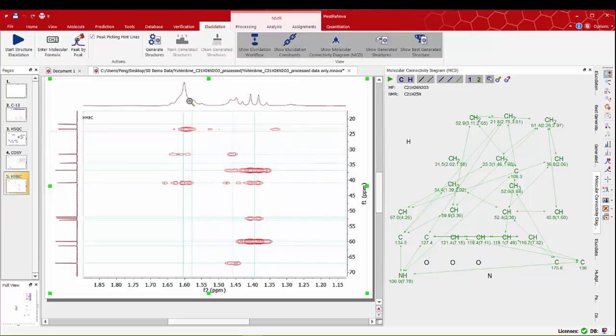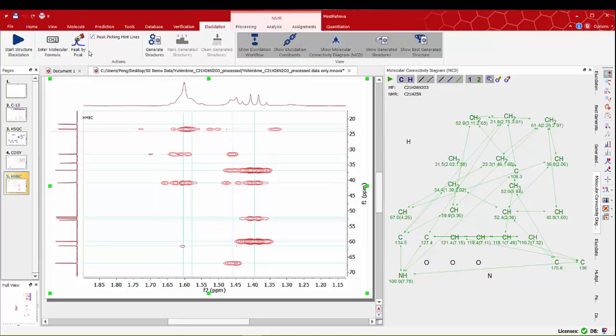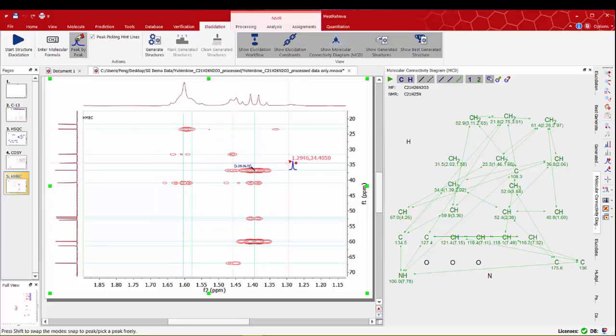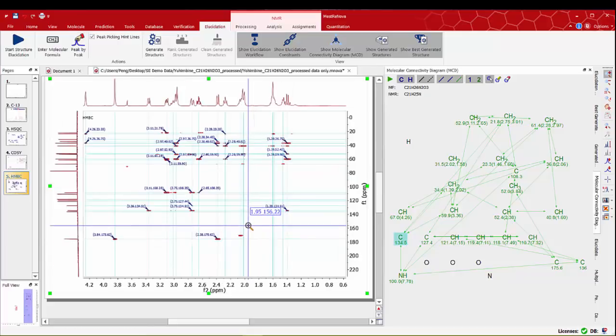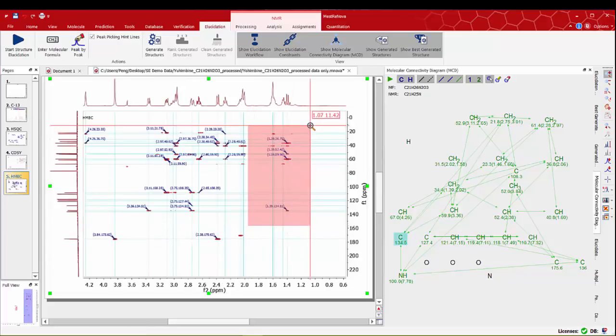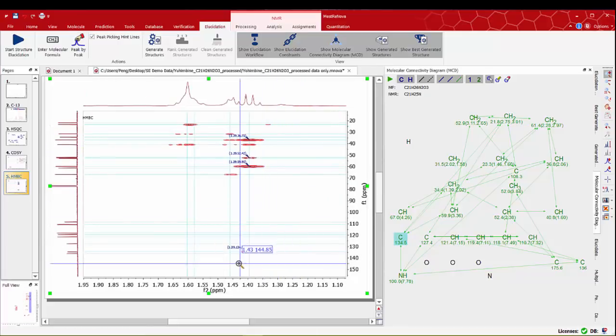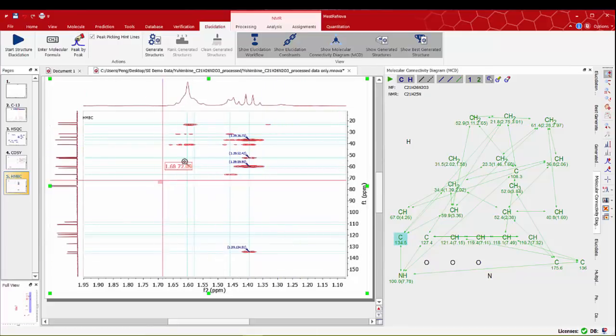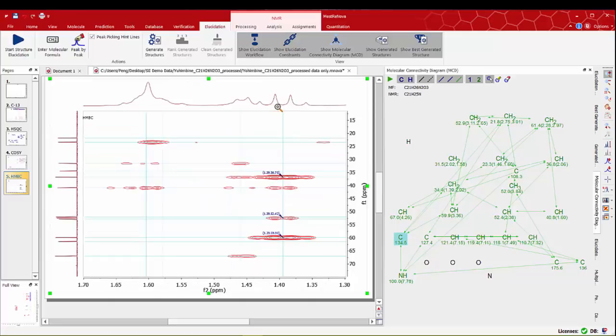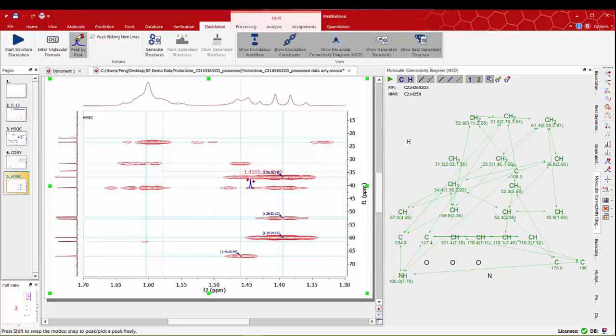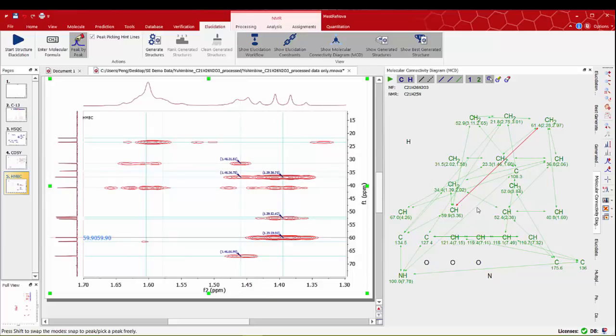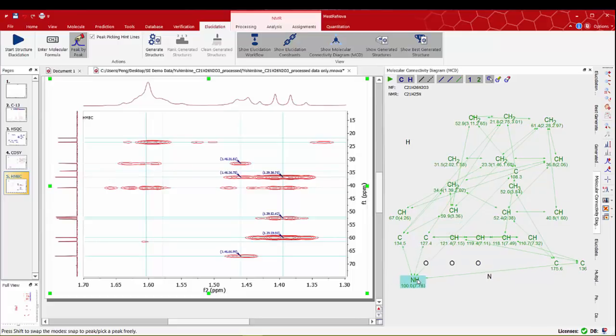There is a final region in the spectra where we can see again a problematic group of protons. We can do peak picking in some of the correlations here with some confidence. We can see some more CH groups interconnected on the MCD panel. Also including NH we manually defined in the earlier connected to some of the carbon atoms.